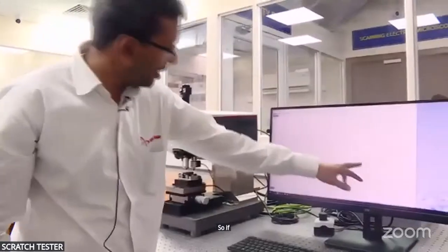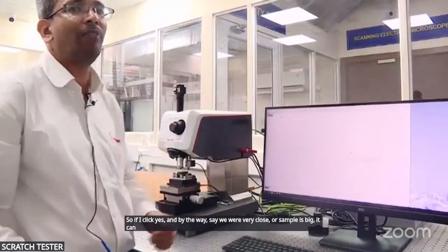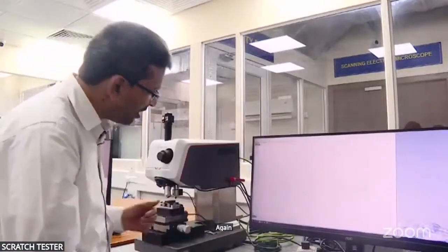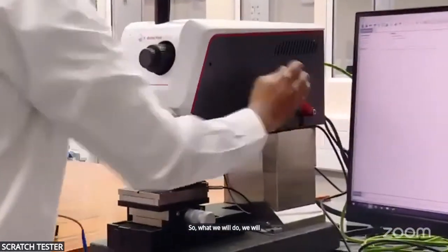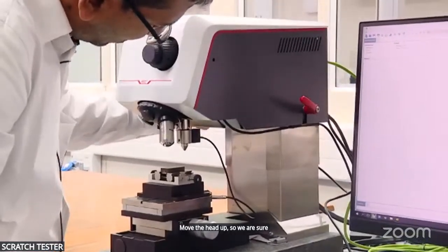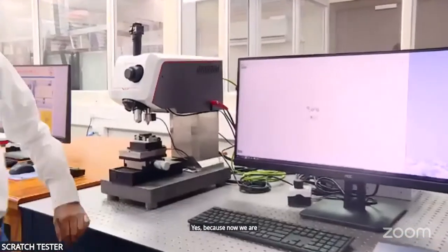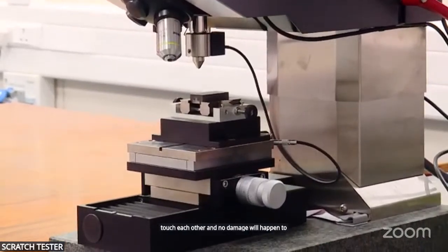So if I click yes, and by the way, say we were very close or the sample is big, it can strike the indenter, we don't want that, because that can cause damage. So this is the pop-up which reminds us to check again that nothing will strike when the table moves. So we will unlock it, move the head up, so we are sure that nothing strikes. We'll close it, lock it again and click yes, because now we are sure nothing is going to touch each other and no damage will happen to the instrument.